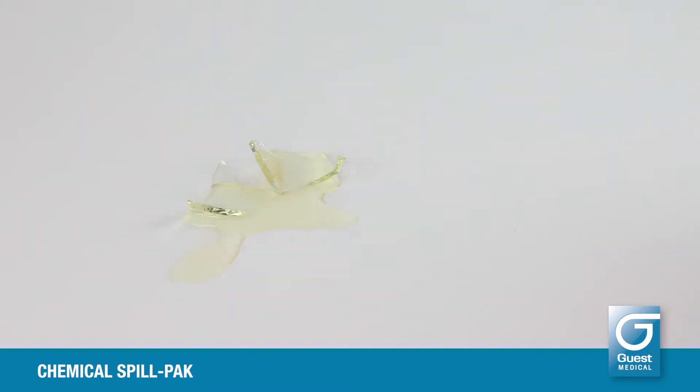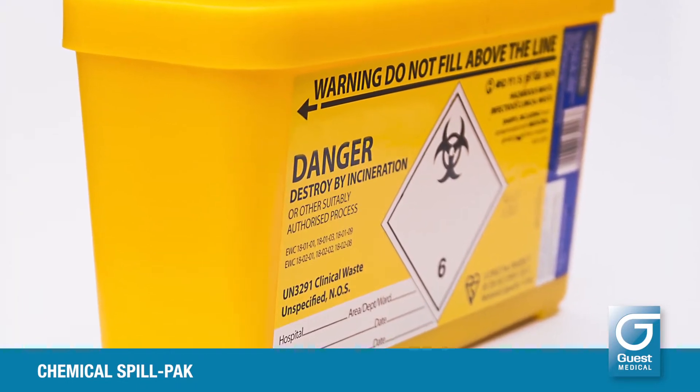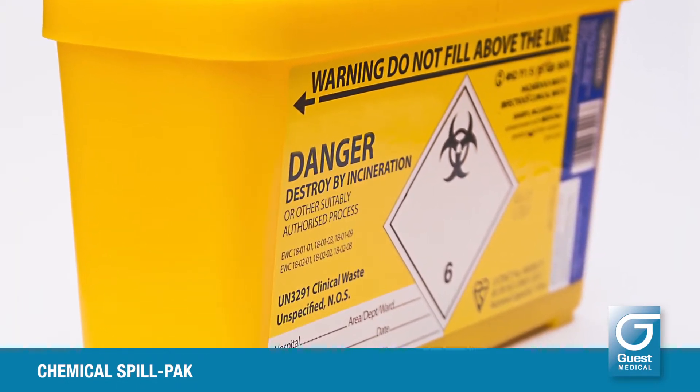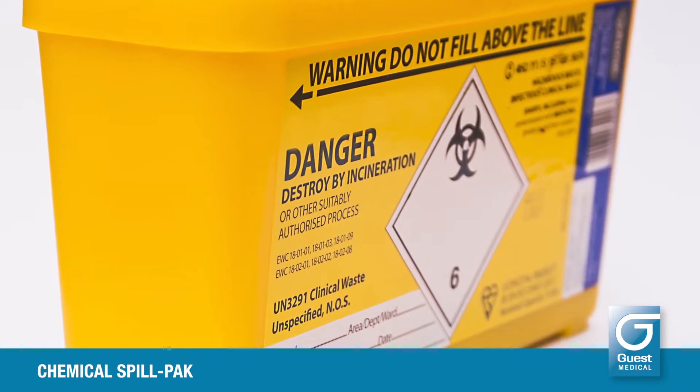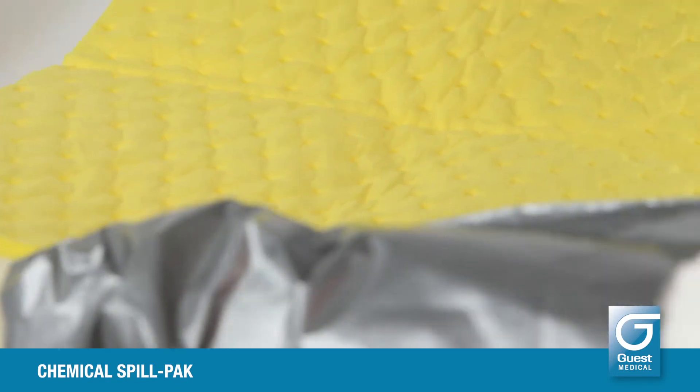Using the disposable forceps, remove any sharps from the spill and discard into an appropriate sharps container. Discard the forceps into the hazardous waste bag. Lay the absorbent pad over the spill and allow all the moisture to be absorbed into the pad.